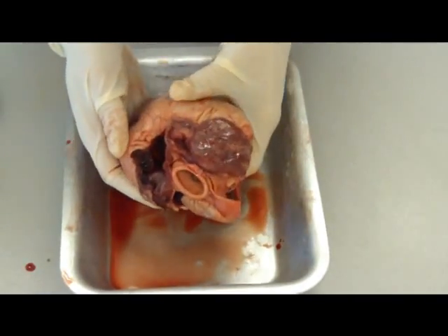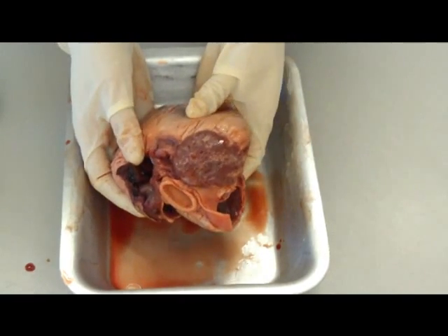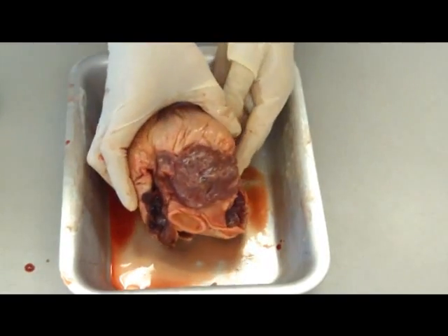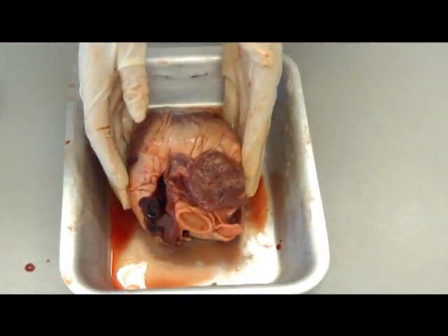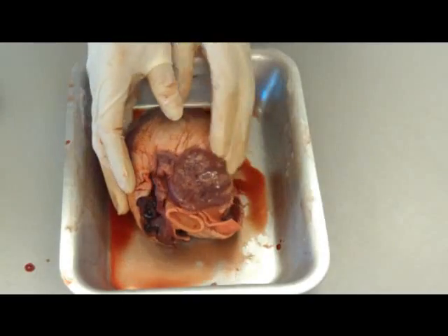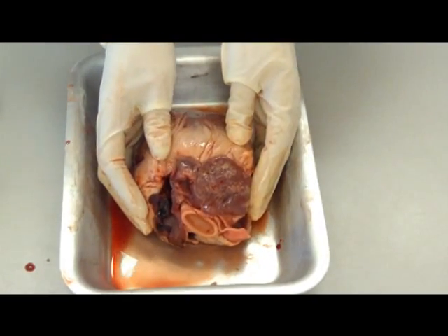On the other arteries and veins that you have, you have the pulmonary artery, which goes to the lungs, and then the pulmonary vein, which comes back from the lungs. Not all of these are able to be identified on here because you can't actually see all the artery - they've been actually cut off for the purpose of this dissection.